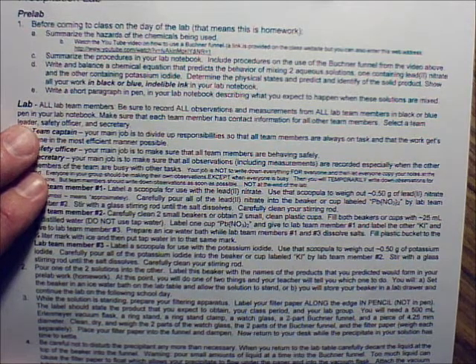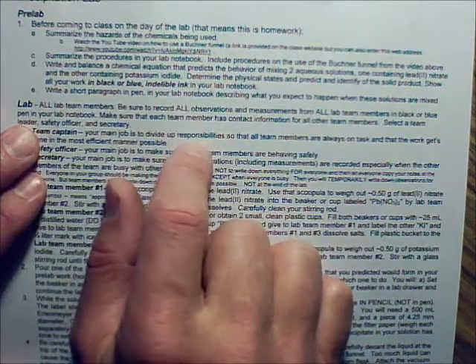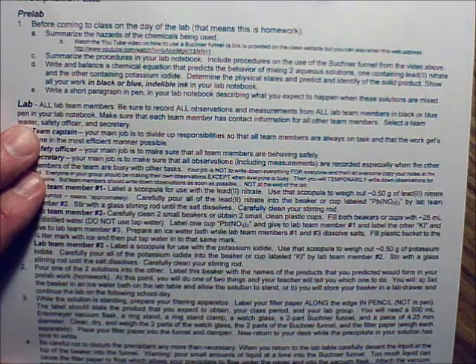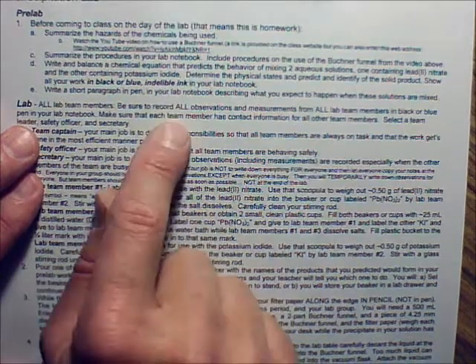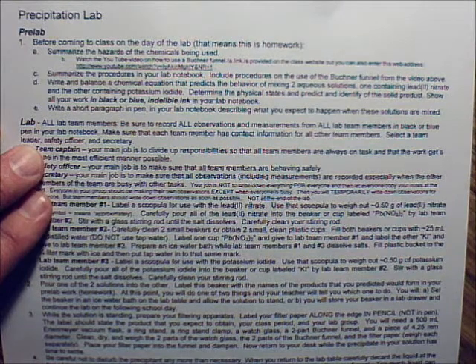Right, somebody's going to not be doing the lab. Remember, I only have a certain number of shoes and pants in here that you wear if you forget to wear what you're supposed to wear. Okay? Safety first. Wear your own clothes. Shoes and long pants. Otherwise you get all these staph infections and diseases.